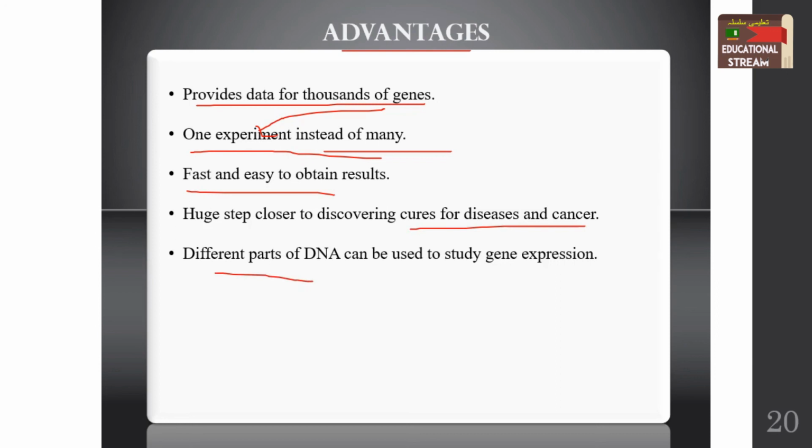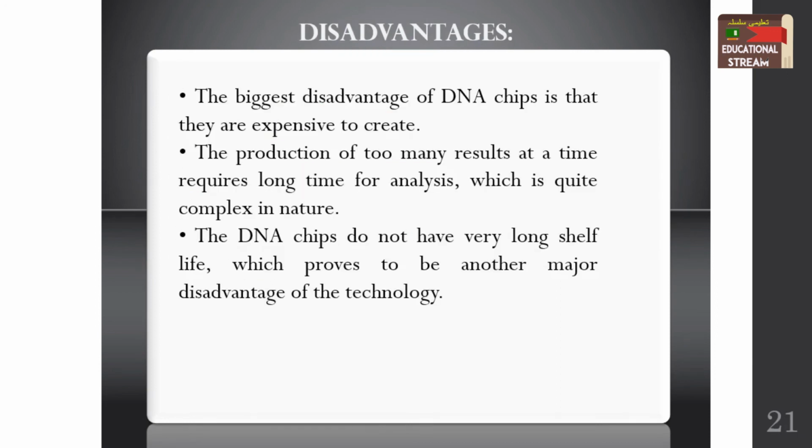the gene expression. The main disadvantage of DNA microarray is that it is too expensive to create, to prepare the chip. It is not economical, and with the production of too many results at a time, it requires longer time for the analysis, which is quite complex in nature.